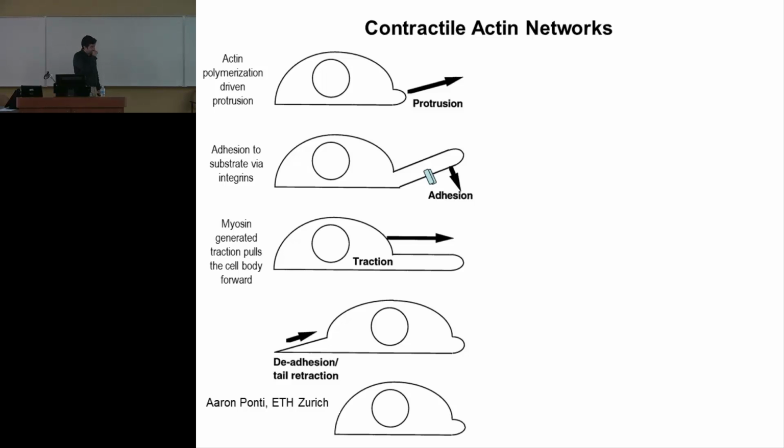Okay, so now the same speckles and the same kind of analysis in a different protein structure. Actin and microtubules are the 2 main cytoskeletal proteins in all cells. For example, actin is the protein that is very active in cell protrusion. In wound healing, when we have a cut and the cells are moving to close the wound, the actin is the one that forms networks at the tip of the cells.